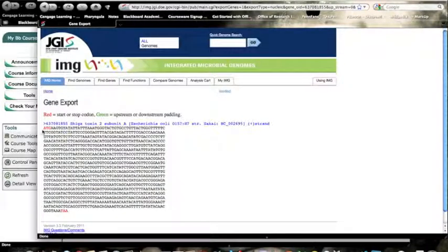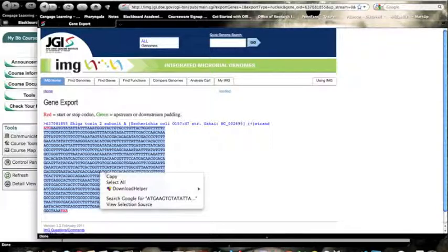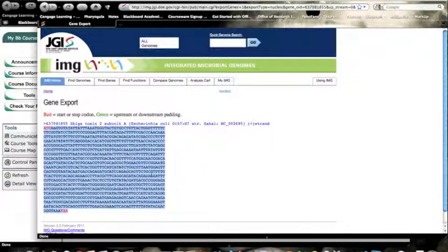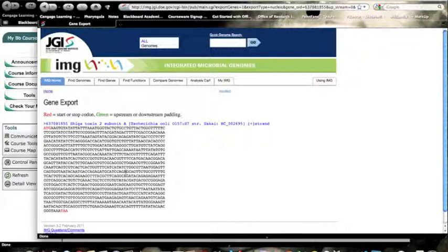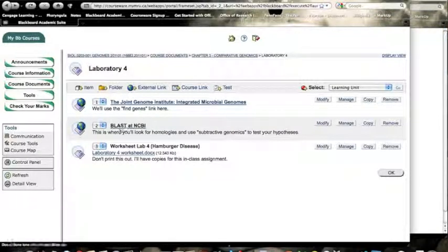What we want to do is blast this against the genome of just regular E. coli. So what we've done up to this point is we put in a toxin name, we searched through a pathogenic organism, we found that gene, and now I want to go back. So let's go over here, back to blast.